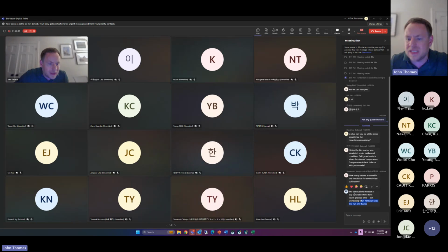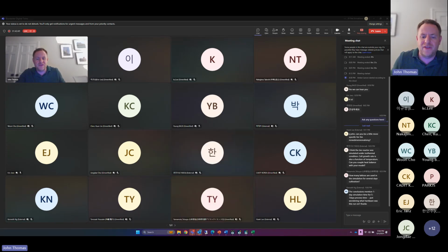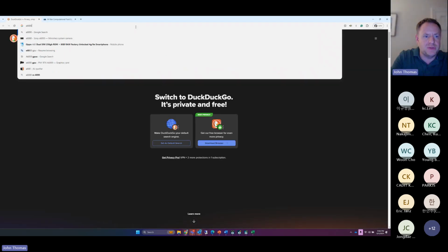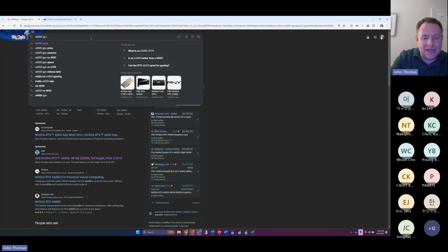Wonder what hardware? That was an A6000 GPU. It was a workstation. I need to double check. It was a single GPU. It was either an A6000, which is a few $1,000, or it might have been an A5000.